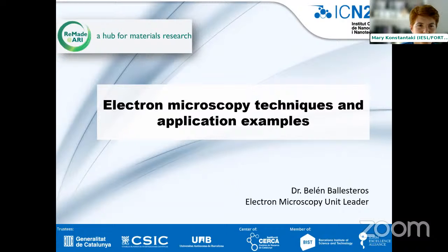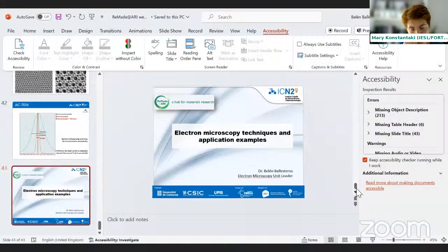So in the meantime, I have a question, Belén, if I may. Yeah, sure. About EDX, is this done in both the SEM and TEM? Yes. Do you get information on the surface or also on the structure of the sample?